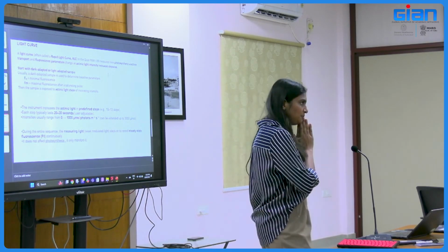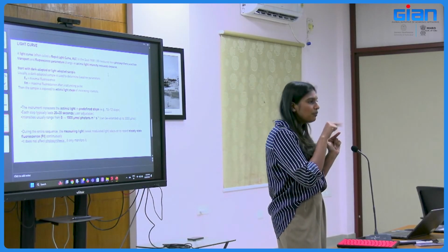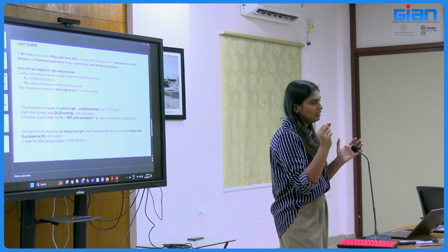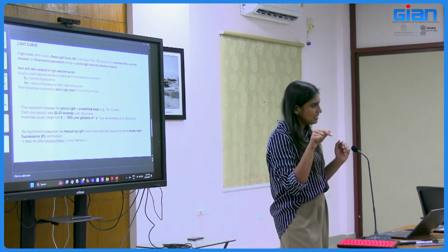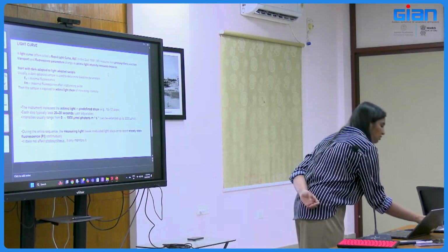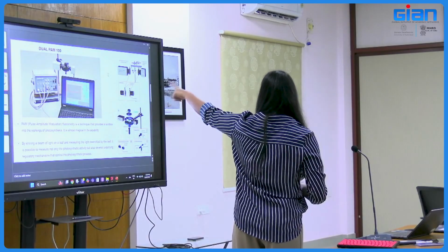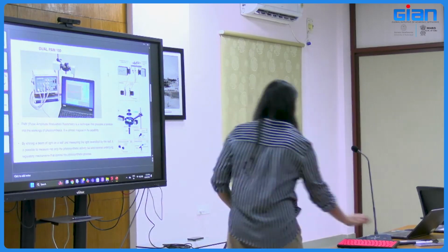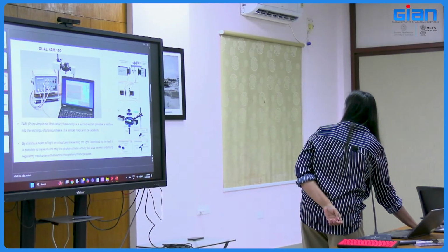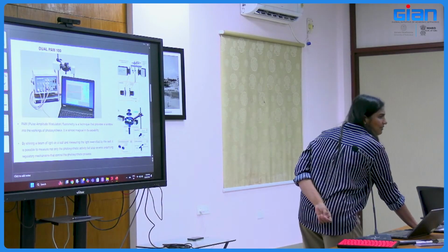Why? Because you are giving a frequency of about 1000 pulses of very weak light, and this frequency is fixed in dual PAM. We showed you the part. If you see the part here, this one, dual PAM, this is where the signal detection happens. This is the detector part, and here you can change both parts. Now it is fixed at the P700 and NIR.